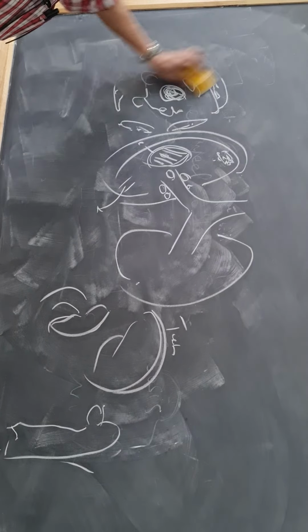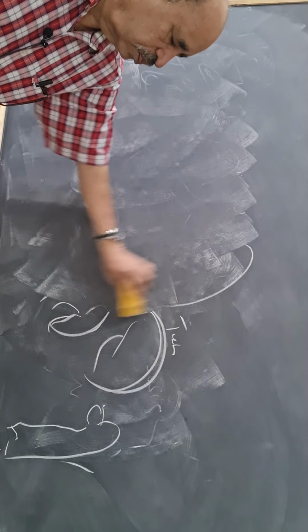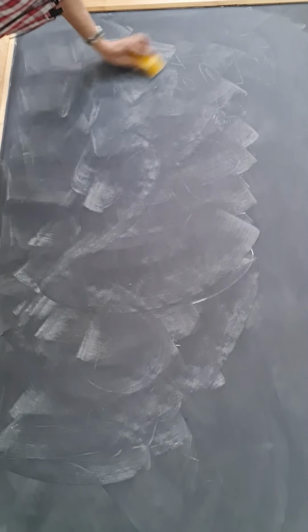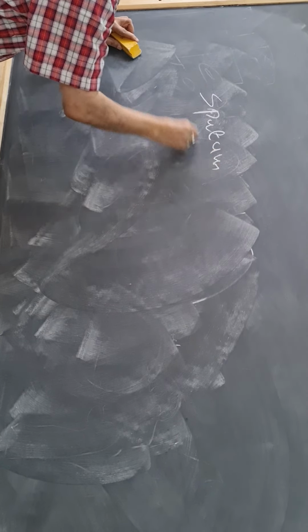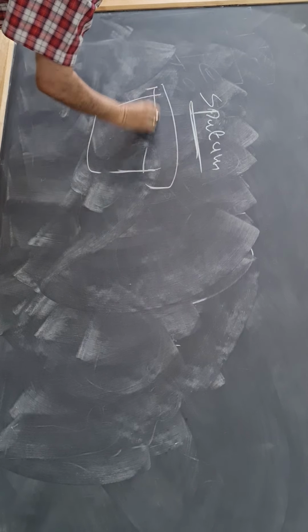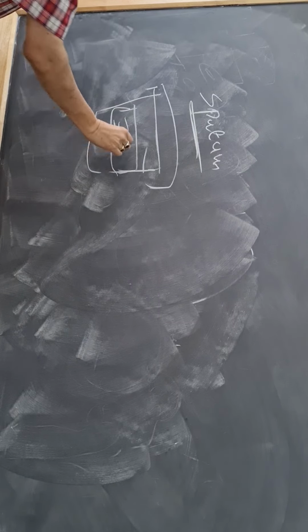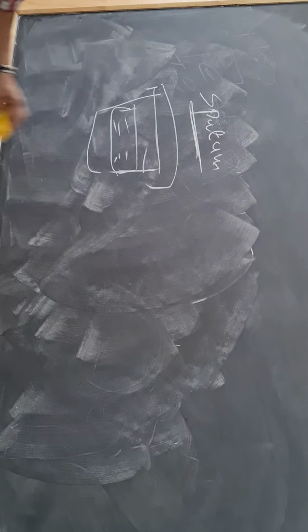So the sputum that we take is sputum. Early morning sputum is best, and it is collected in a wide mouth bottle, perfectly labeled with patient's name, IP/OP number. It should all be written, and now barcodes have come. We give barcodes to each specimen.